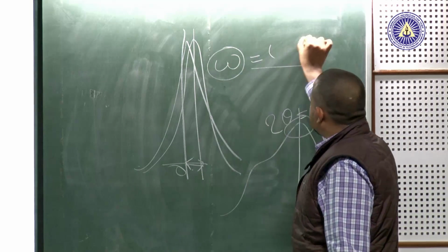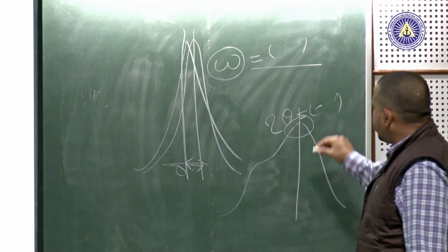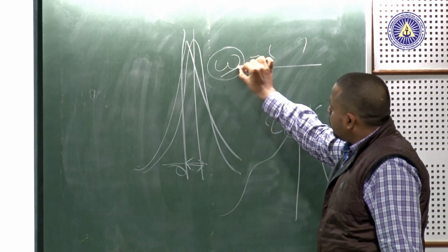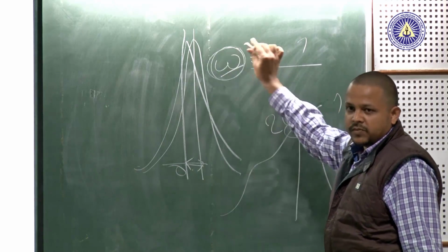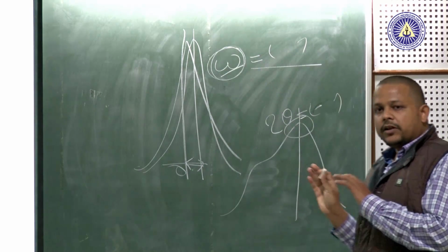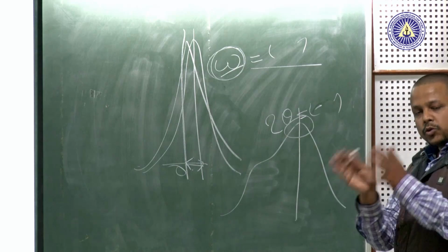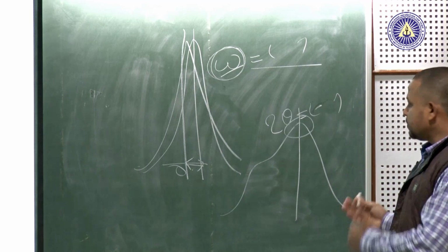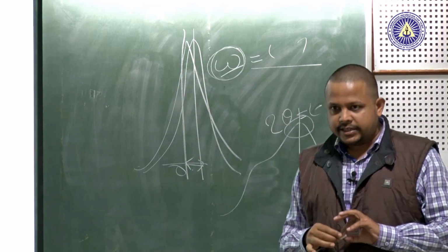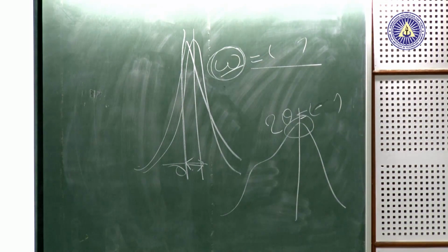This omega will give some value. Then in the software, take this value as 0, so it will not be included in your data, because you already set this as 0, and then take the data from the machine.